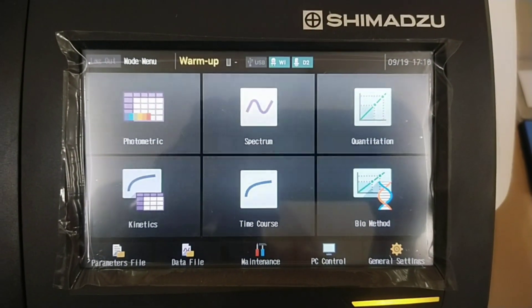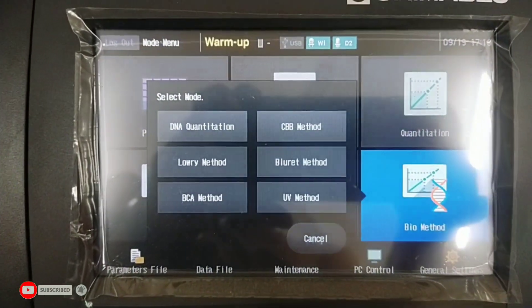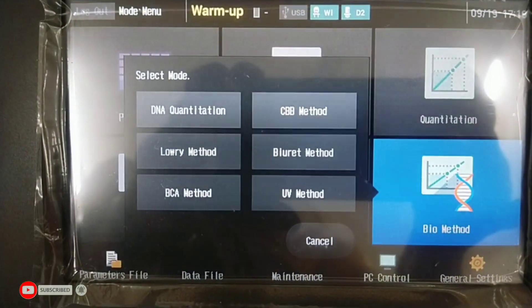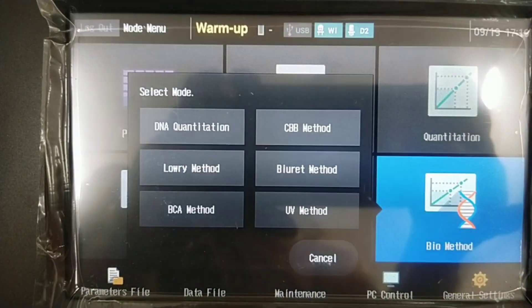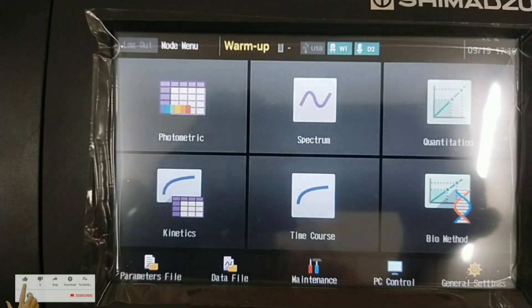Bio method mode allows you to obtain DNA and protein concentration using various quantitation methods: DNA quantitation, Lowry method, BCA method, CBB method, Biuret method, and UV method.